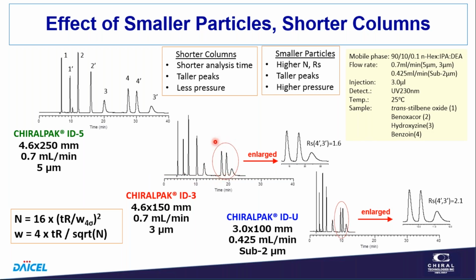This illustrates two things. One is, this isn't just a change from particle size. This, I think, is probably just lot-to-lot variability. And we'll discuss this, and we do this in achiral chromatography too. We'll use multiple lots, different lots of stationary phase, as part of our validation.